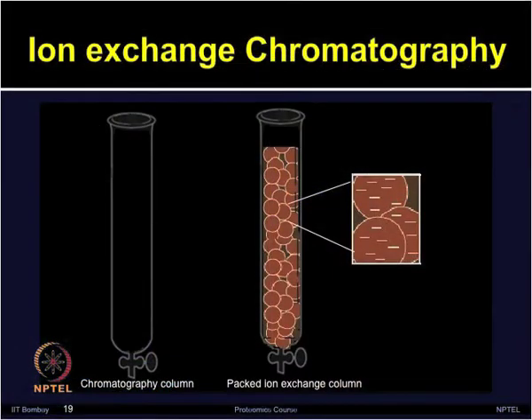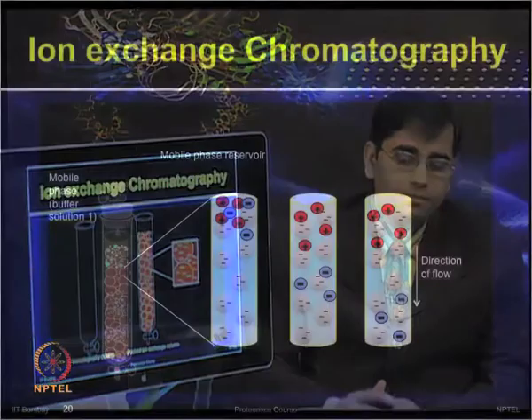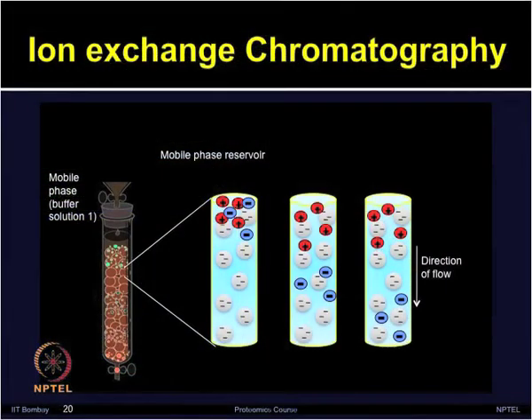So, in ion exchange chromatography, the column is packed with a resin, whether it is cation or anion exchanger, depending upon the charge of the protein that needs to be bound to the column and purified. Proteins are adsorbed to the ion exchange column, and then they can be desorbed by increasing the salt or altering the pH of the buffer, which can change the charge on the protein.